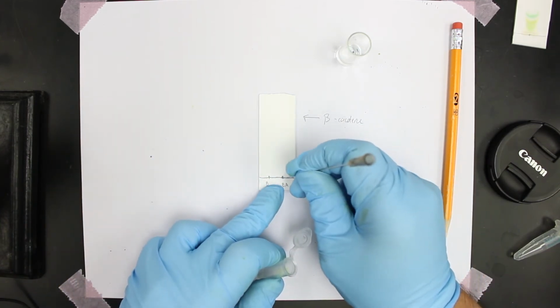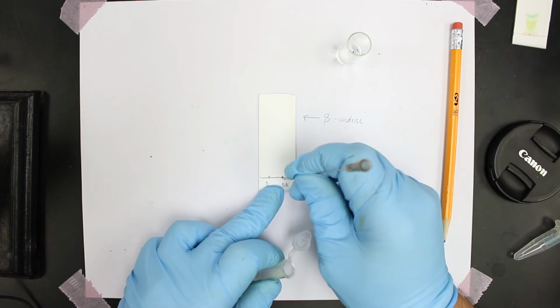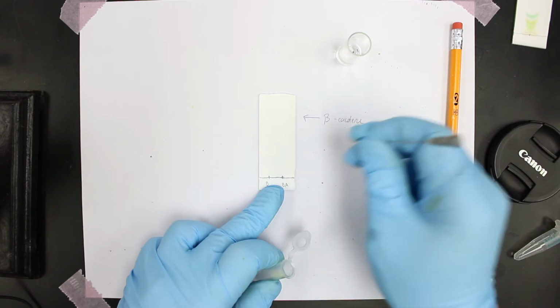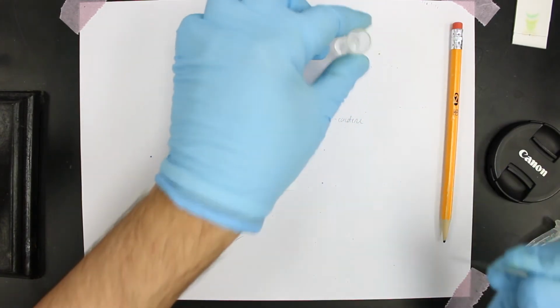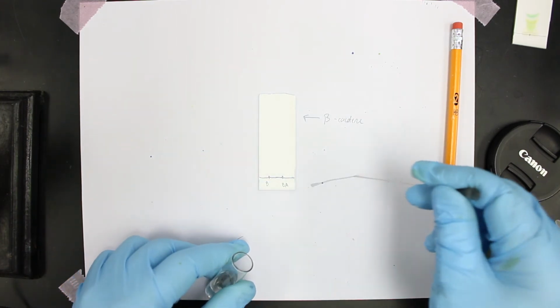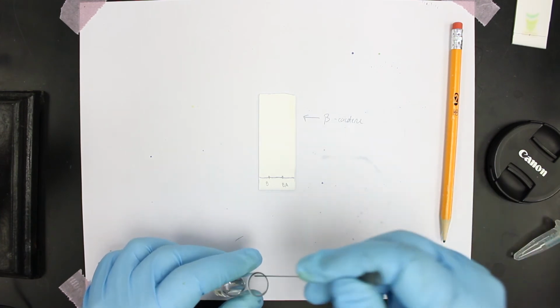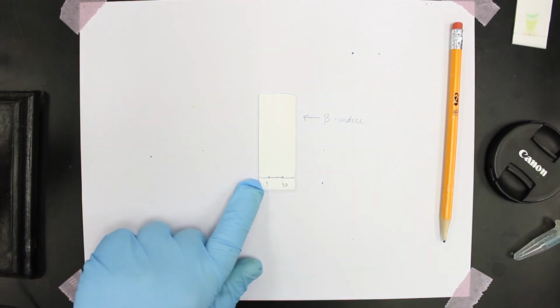And you want to try to keep the spots small because it ensures that there's good separation between the components. If the spot is very large and diffuse, sometimes the spots can overlap. Okay, that should be good. Then we'll clean out our spotter. Okay, so now we have our prepared TLC plate. We can put it into the chamber.